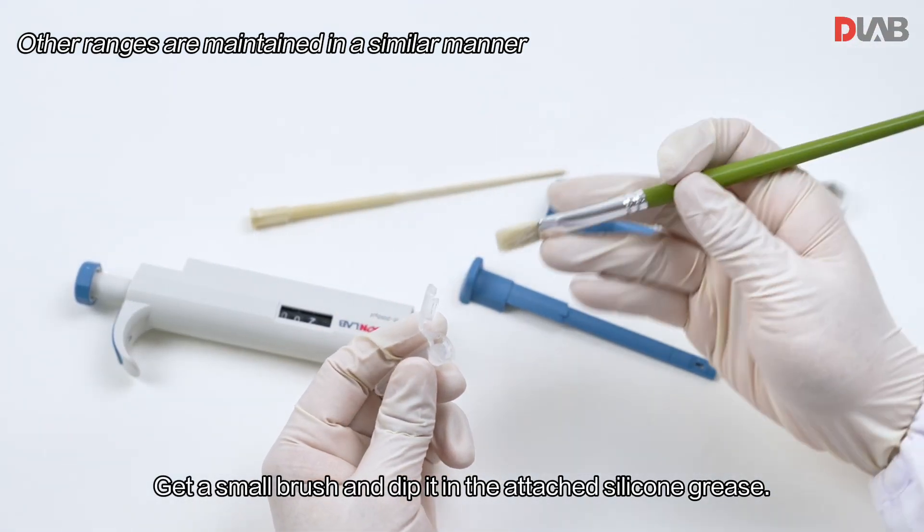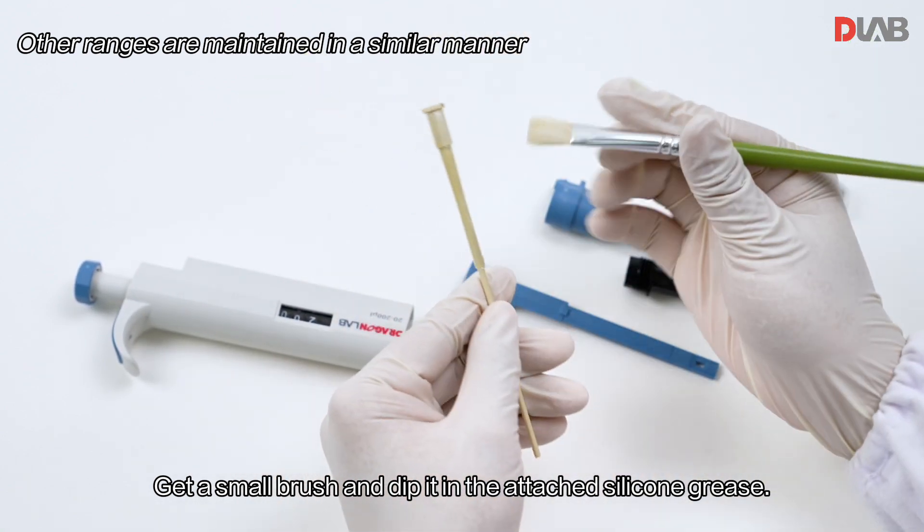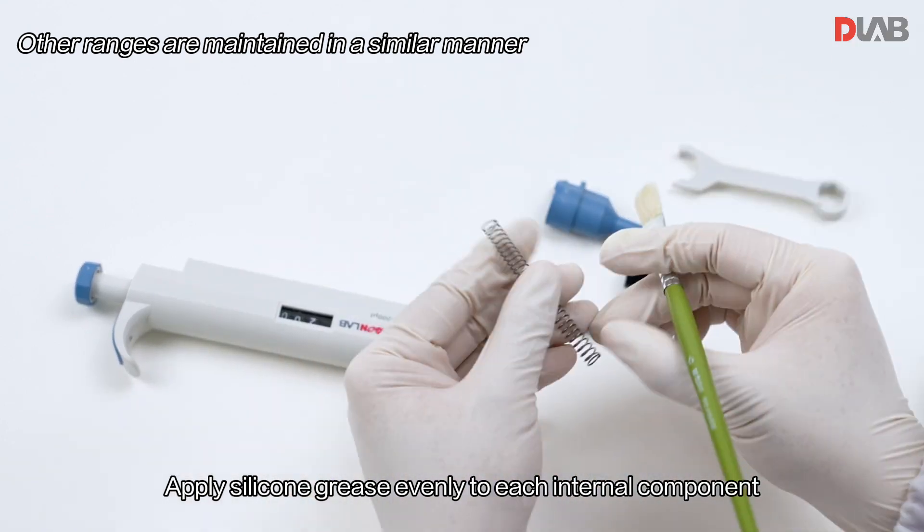Get a small brush and dip it in the attached silicone grease. Apply the silicone grease evenly to each internal component.